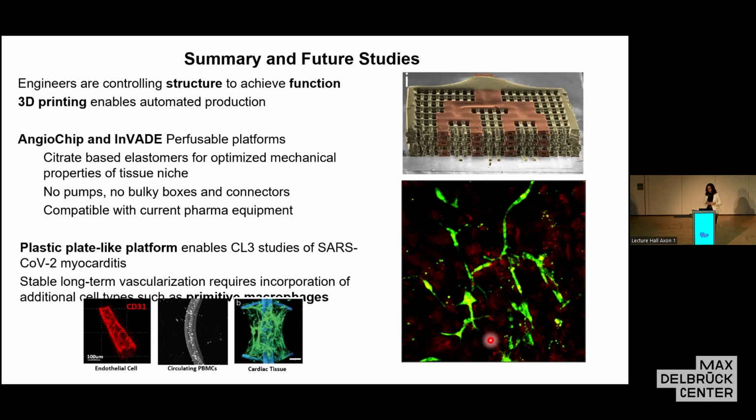So this last part of the work on vascularization and even the SARS-CoV-2, there was no electrical stimulation. With macrophages, we didn't stimulate on purpose because we didn't know what would be the effect of electrical stimulation on macrophages. We started stimulating some tissue and we saw that the shape is changing. There is Michael Monaghan at Trinity College Dublin. He actually has similar iPS-derived macrophages. He's found an electrical stimulation protocol that they like, right? You don't want to polarize them towards something that's pro-inflammatory by stimulating.